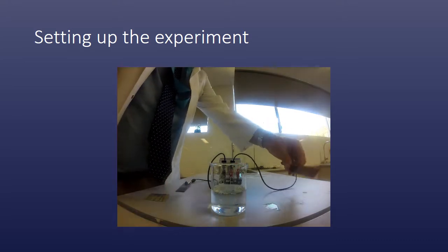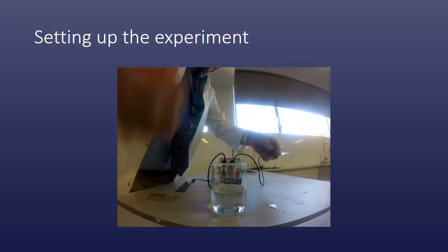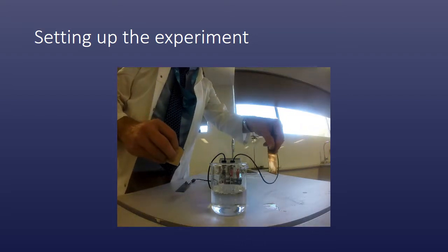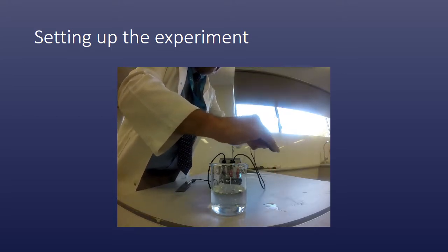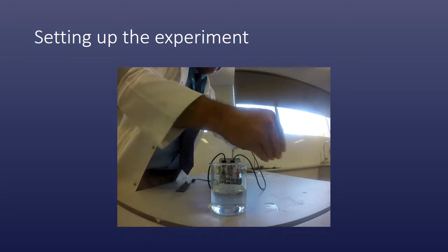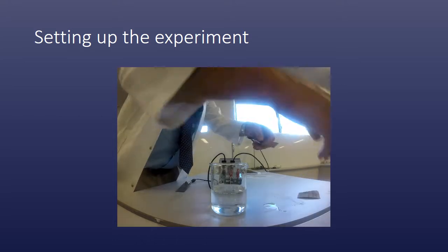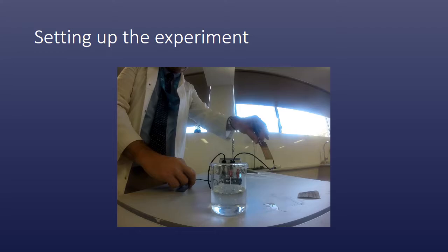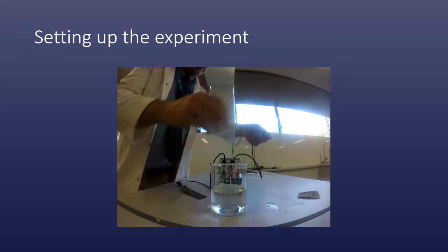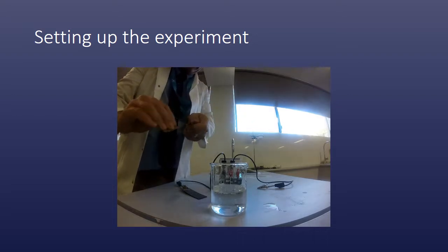And I have another one over here, make sure it's dry as well, and it's copper. You can see the copper colour, possibly. It's a little discoloured, so again I'm going to give it a quick rub with the emery paper to see if I can remove some of the deposits. Our electrodes are used quite often, so we don't always know what state they're in. We want to make sure that we get good connections. The connections, of course, need to be solid all the way through this little circuit.